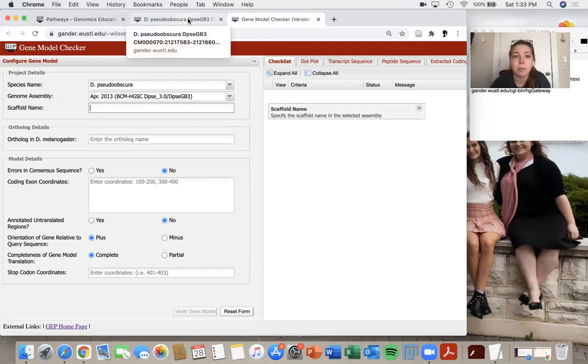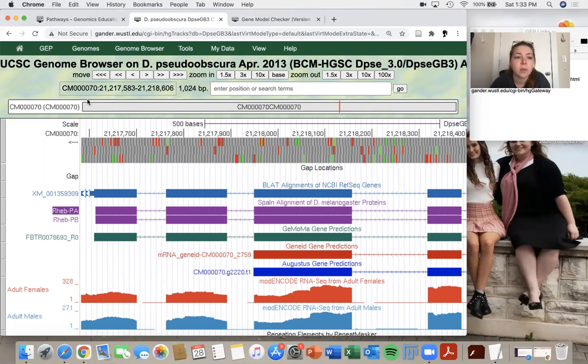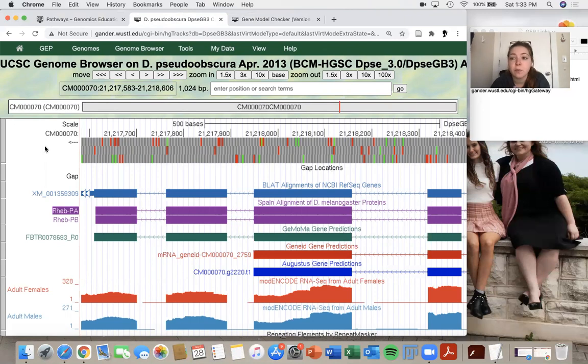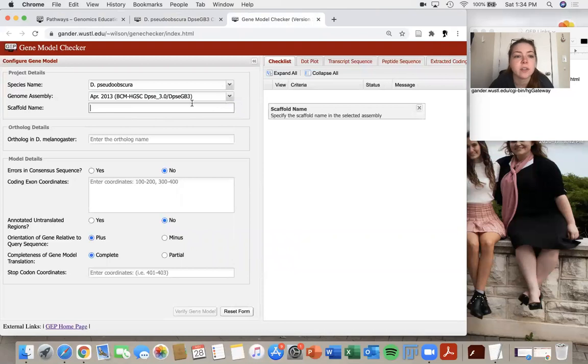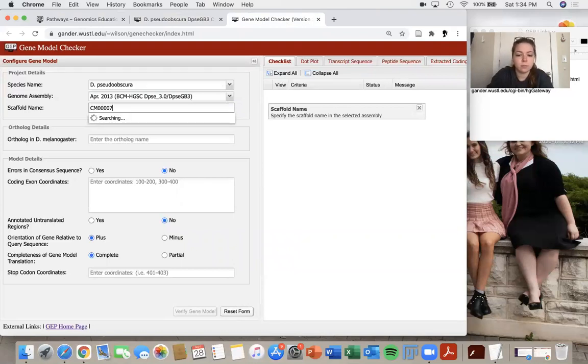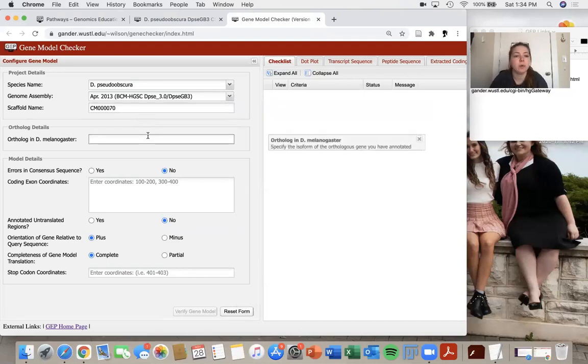So to find the scaffold name, I'm going to go back to my genome browser and I can find the scaffold name in several places. So I can either find it up here before the semicolon over here or under the scale. So the scaffold for my gene is CM four zeros and a seven zero.